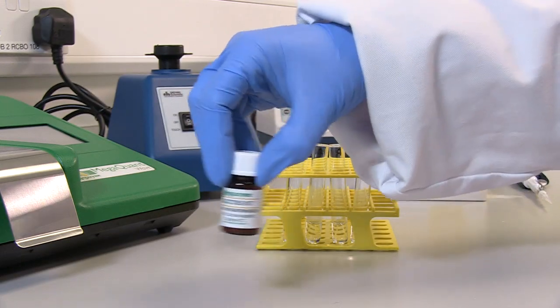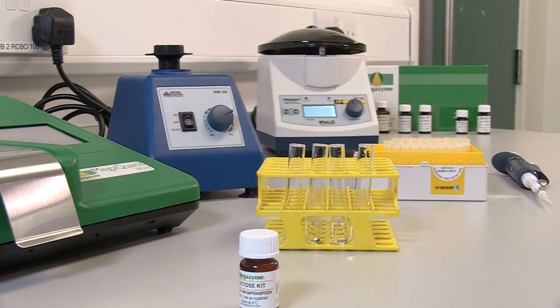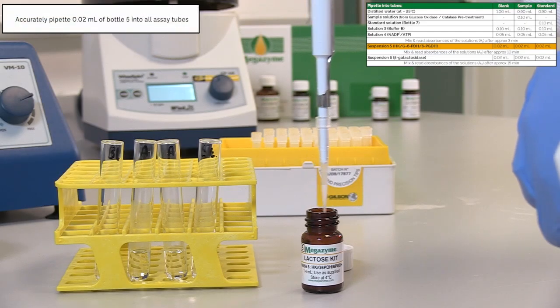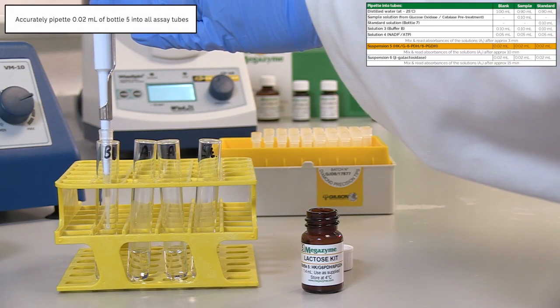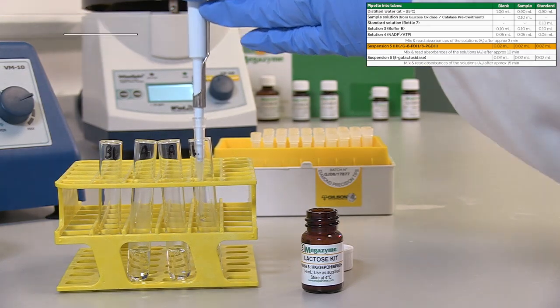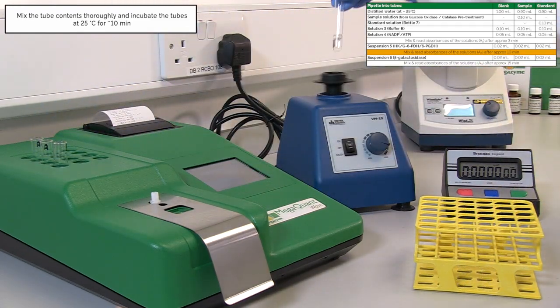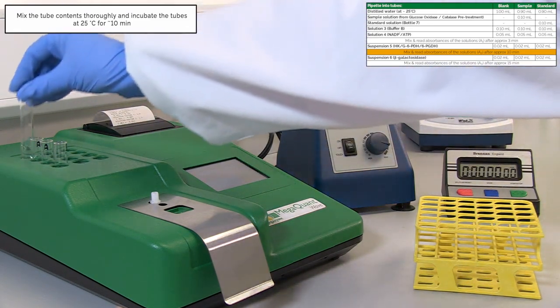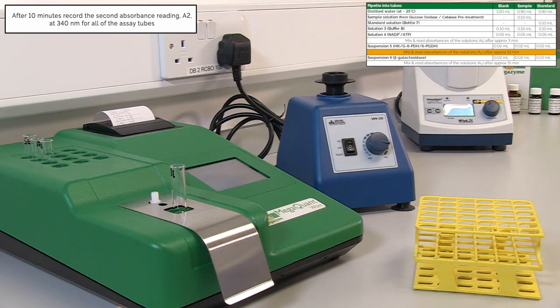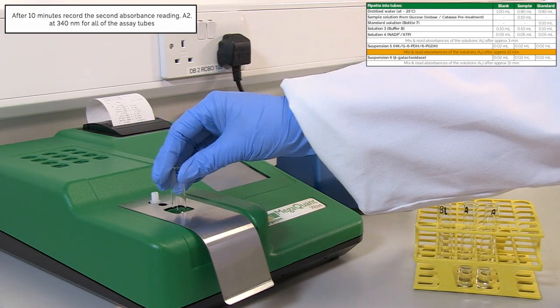Swirl to mix the contents of bottle 5, hexokinase plus glucose 6-phosphate dehydrogenase plus 6-phosphogluconate dehydrogenase suspension, prior to dispensing. Pipette 0.02 ml of bottle 5 into all assay tubes. Mix the tube contents thoroughly and incubate the tubes at 25°C for approximately 10 minutes. After 10 minutes, record the second absorbance reading, A2, at 340 nanometers for all of the assay tubes.